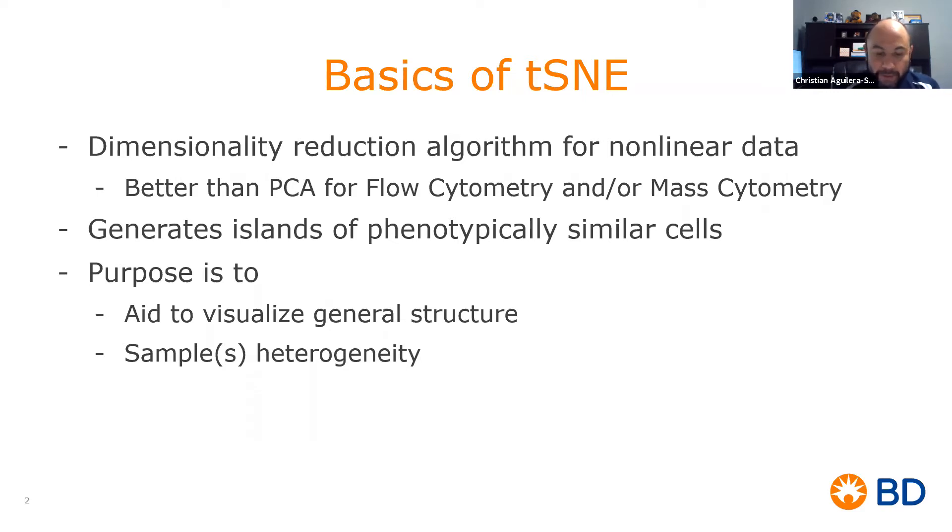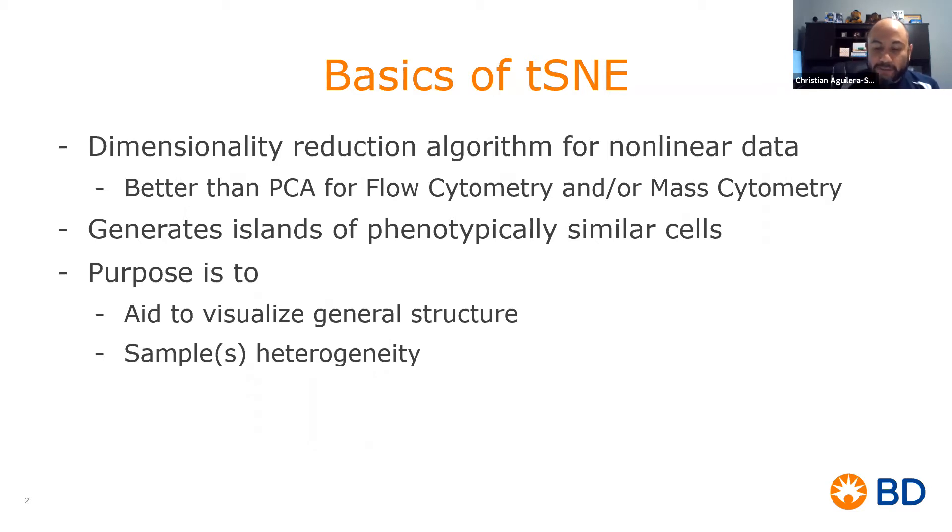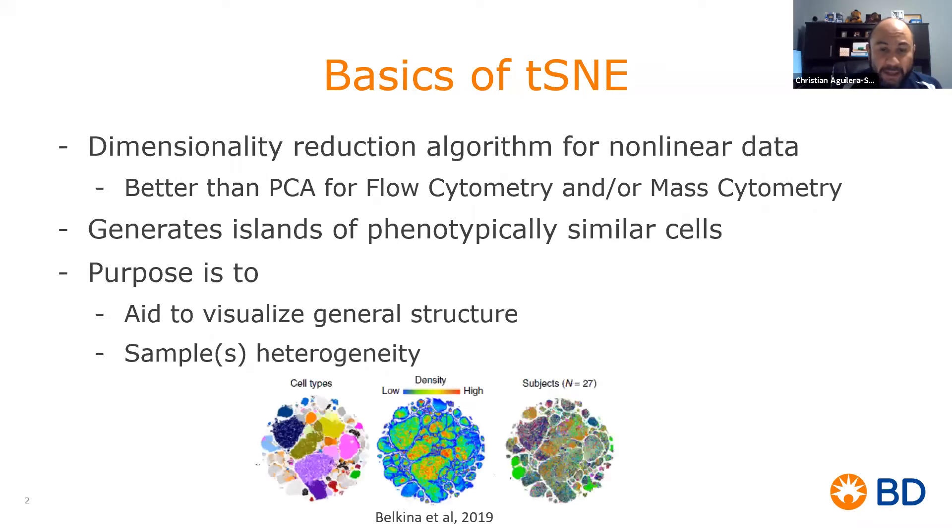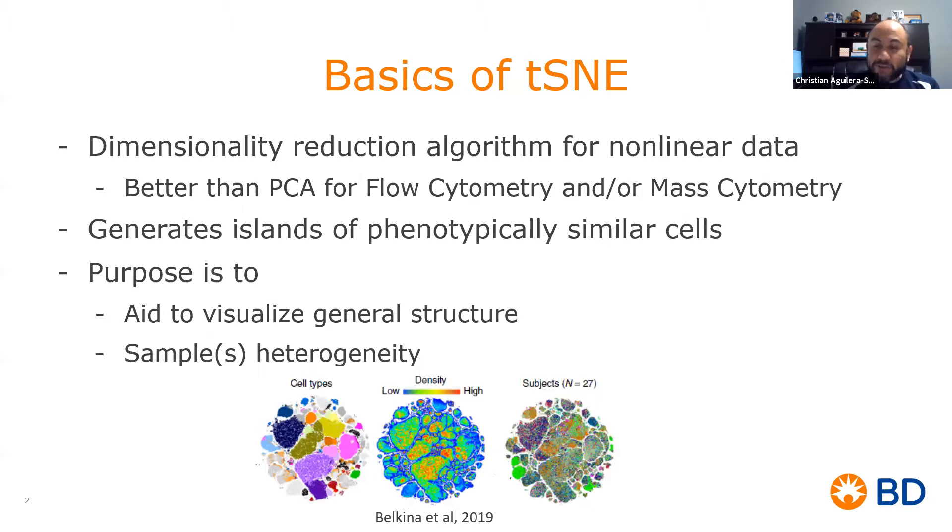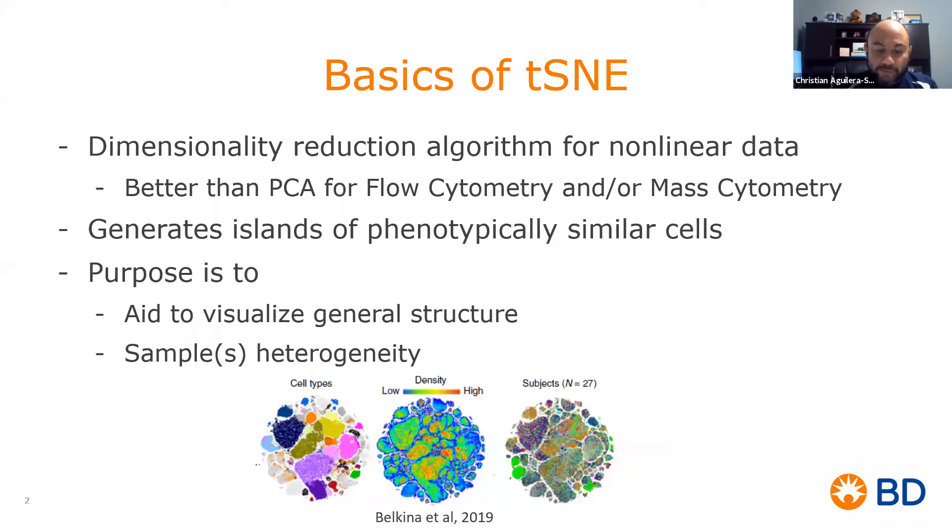A t-SNE map is composed of groupings or islands of phenotypically similar cells from one or multiple samples. A t-SNE map's purpose is to help visualize the general structure and heterogeneity of a data set as well as to provide insight of important differences between samples.